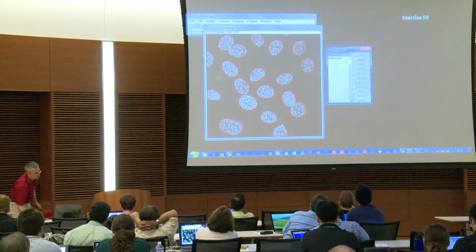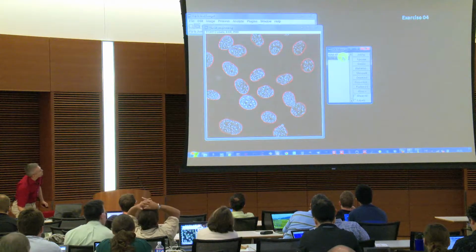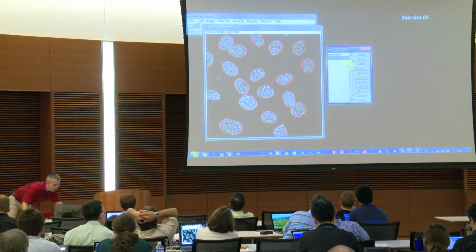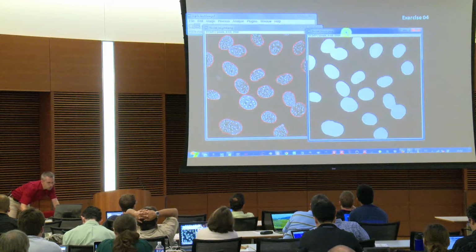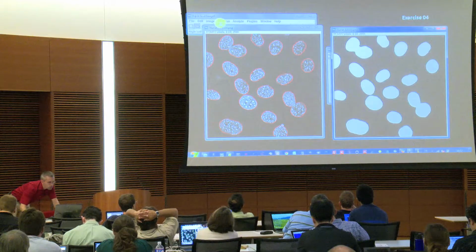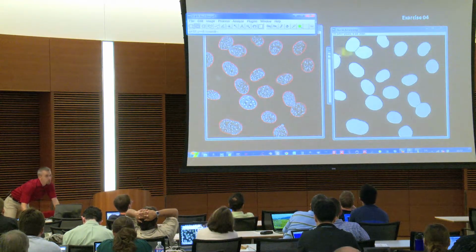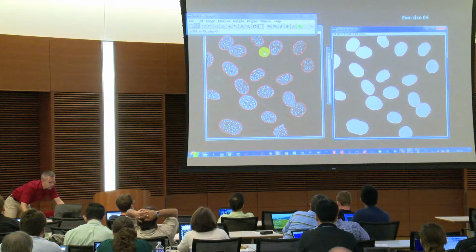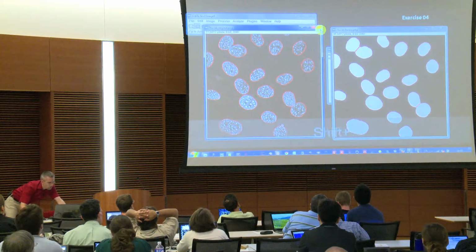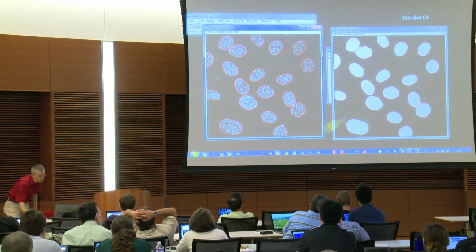This was the first option, and this is the next option, and then you see that it's actually nicely fitted. Actually, I forgot the watershed, so in this case, what we still would need to do is separate those connected ones, and that is here nicely working with the standard watershed without separating any others. So we could create a selection here with separated particles and nicely fit ROIs.